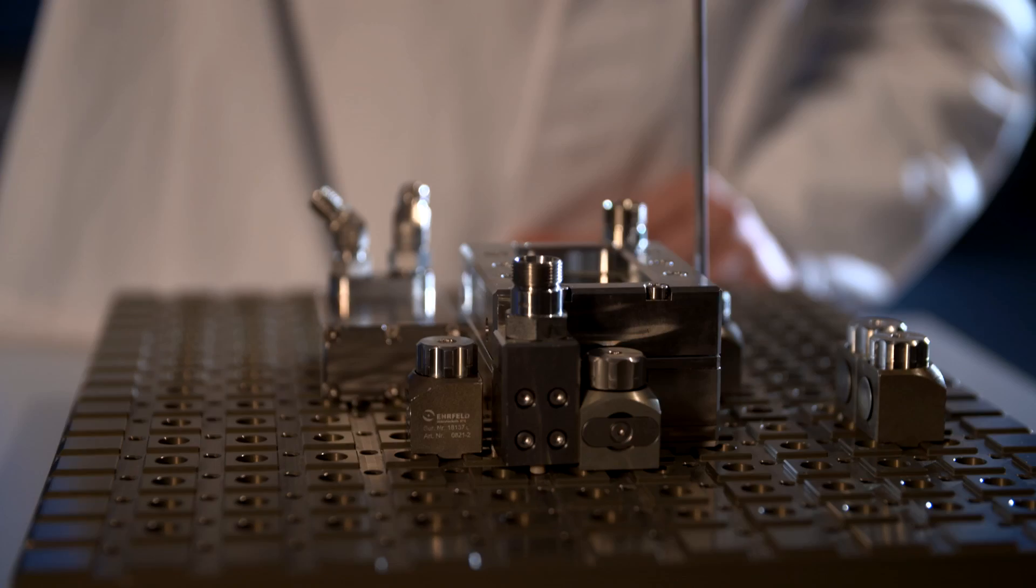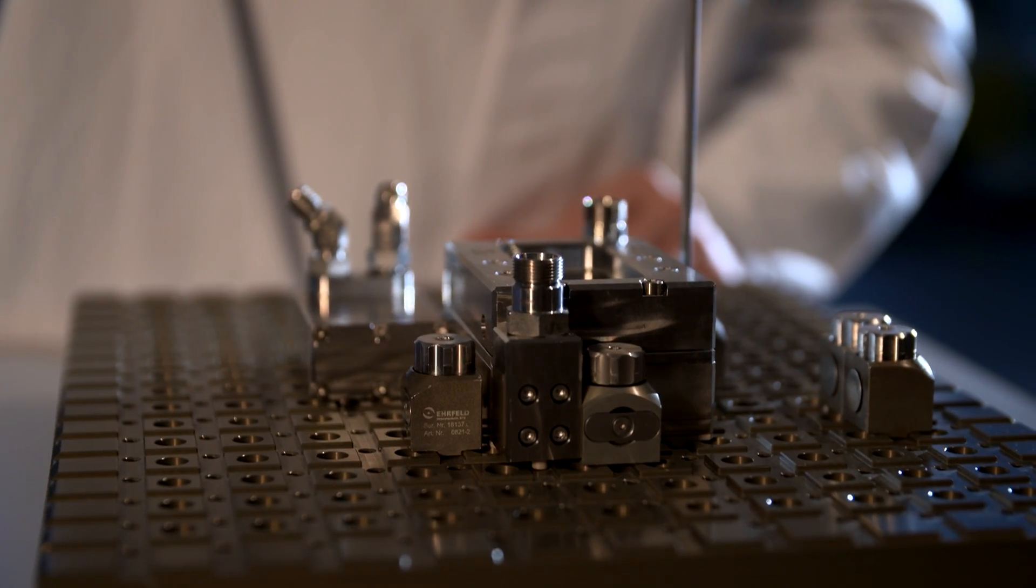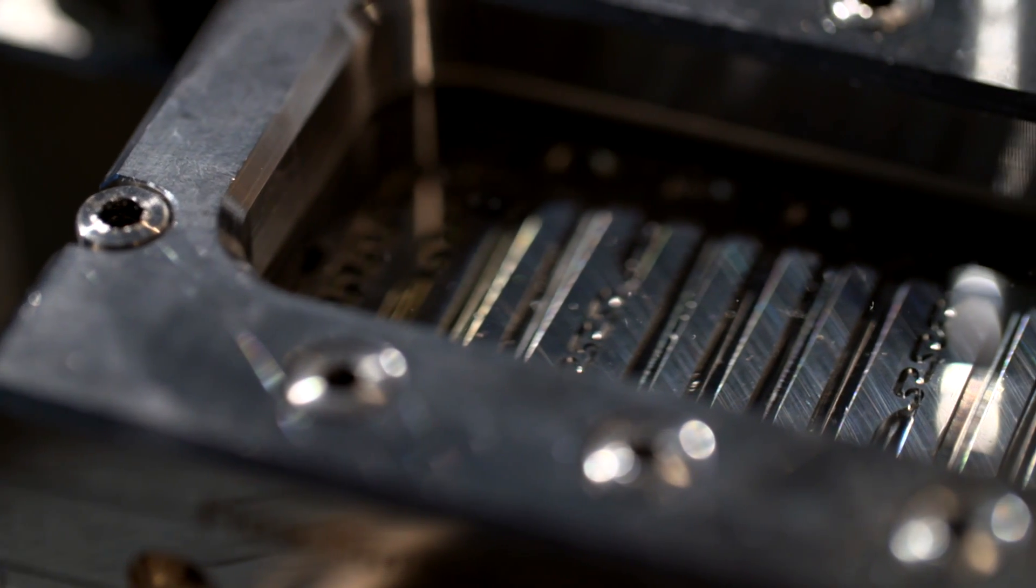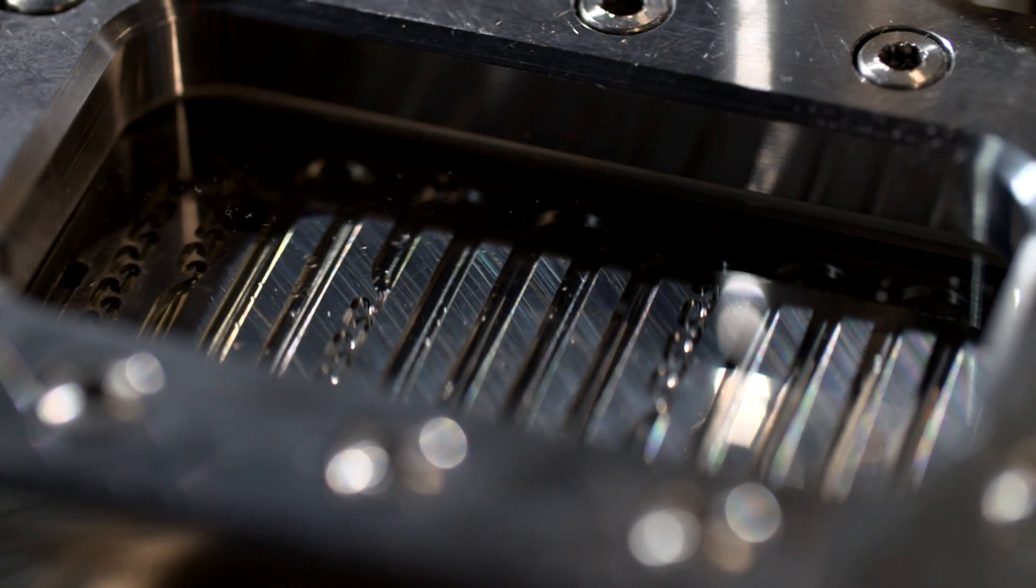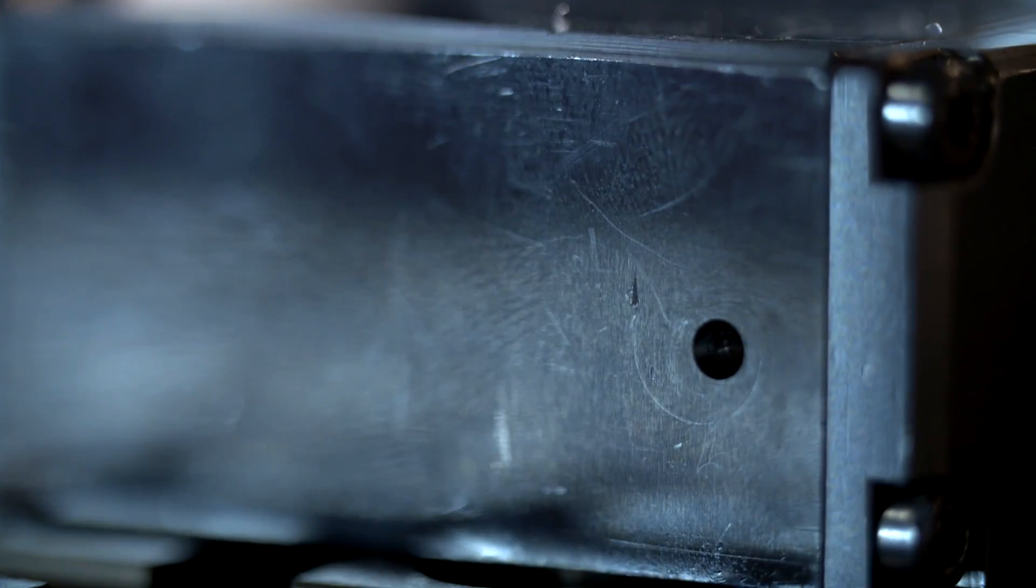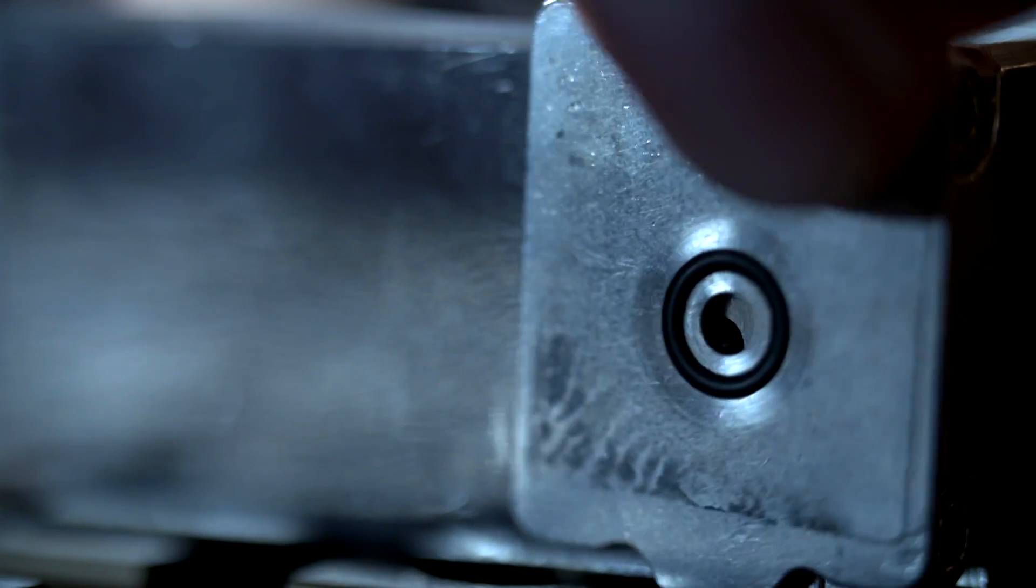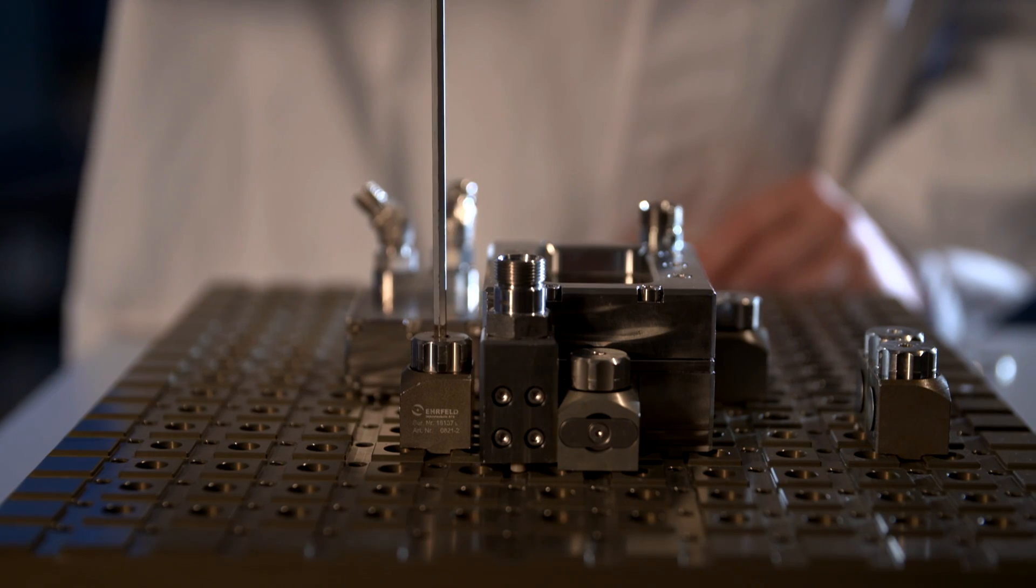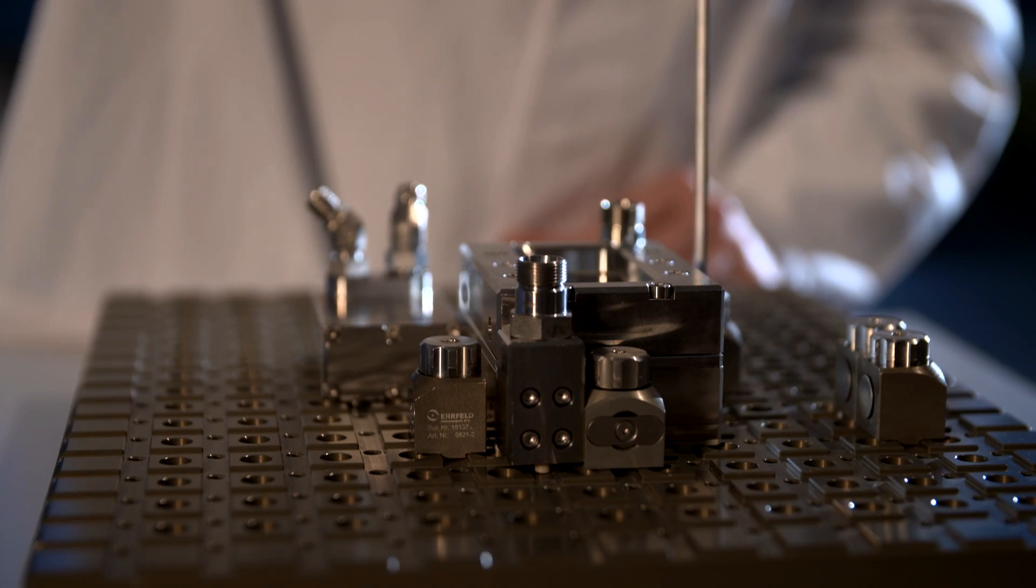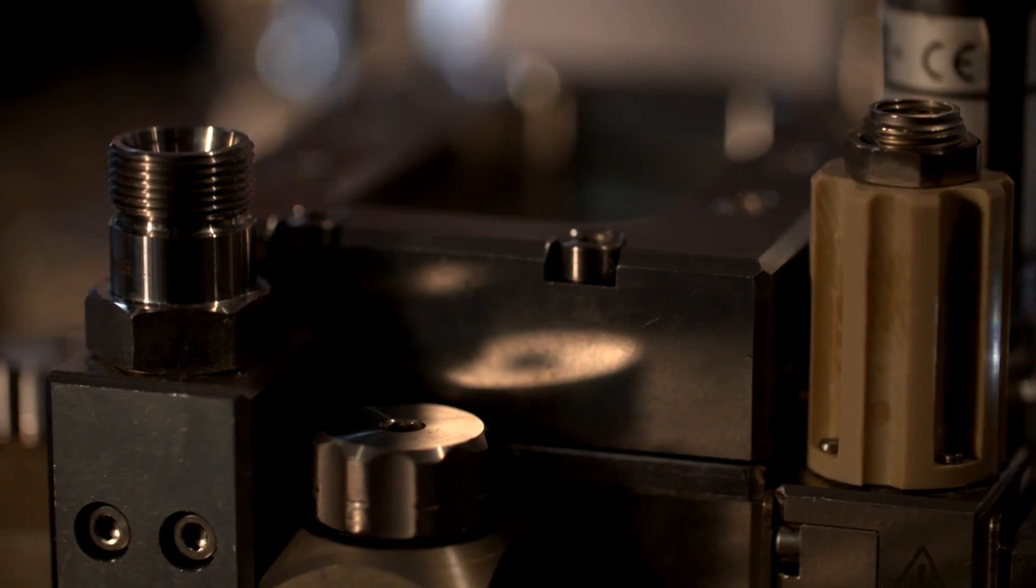The small stainless steel parts carry out a variety of functions, like that of a mixer, heat exchanger, and sensor. The chemists place a special reactor in the middle of this unit. The channels are only a few millimeters wide in all of the components. That allows for a very rapid exchange of substances. And because of the large surface-to-volume ratio, the chemicals are quickly able to absorb and give off heat.